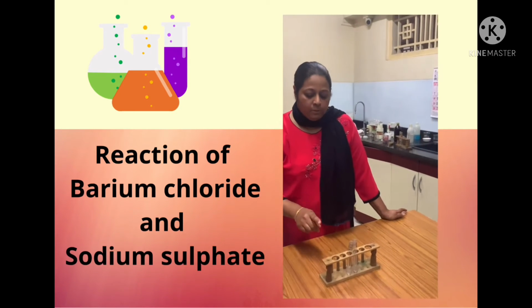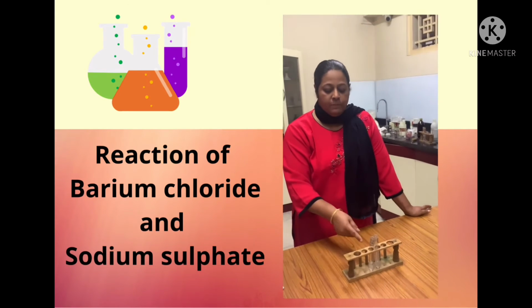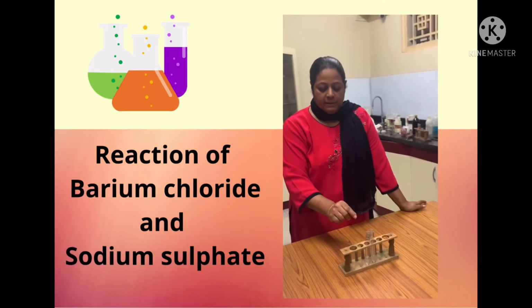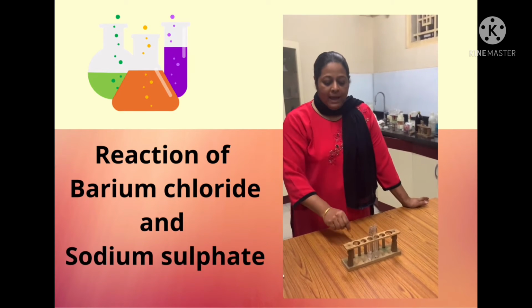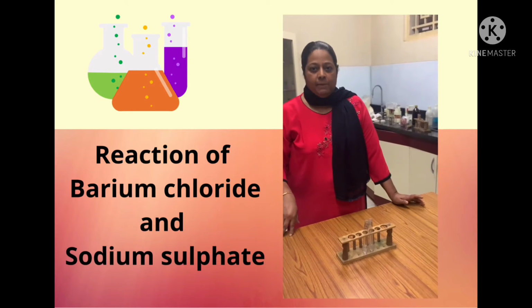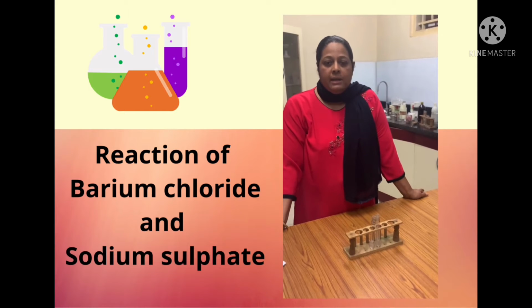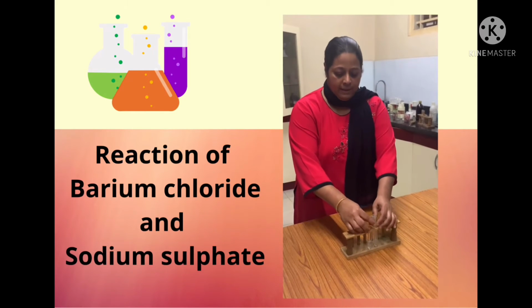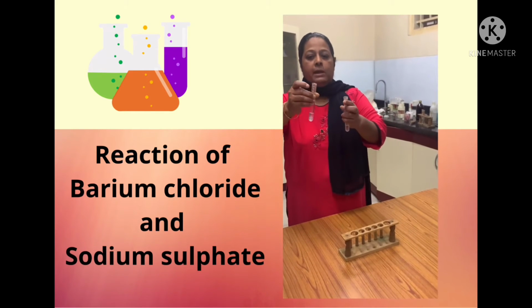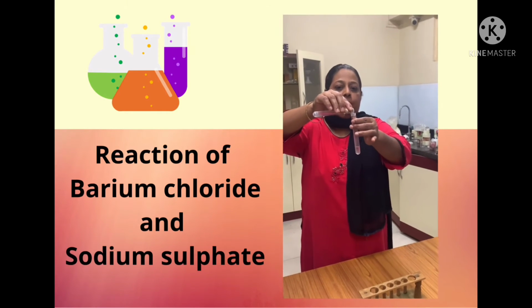Now what we are going to do? We are going to pour one of the solutions into the other one. So from one test tube, we are going to mix the chemical into the other test tube and shake the test tube and allow it to stand for some time. There will be a PPT which will be formed, which we are going to note in the observation table. So I am going to take this barium chloride and I am pouring it in the sodium sulphate solution.